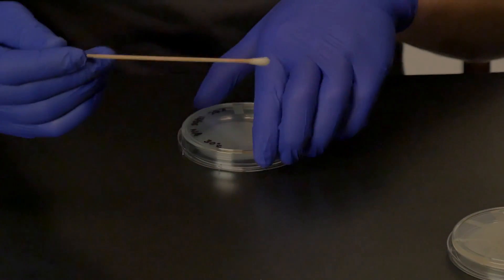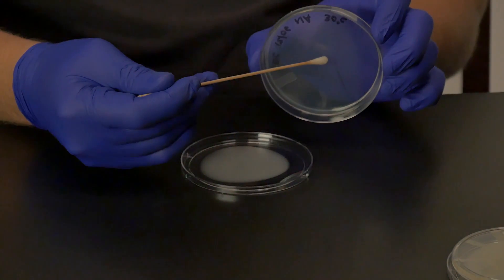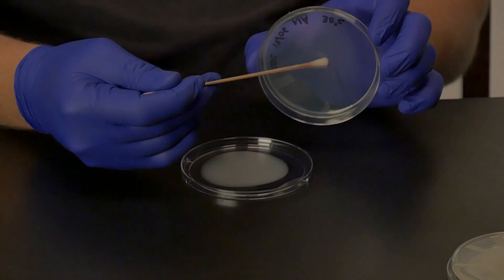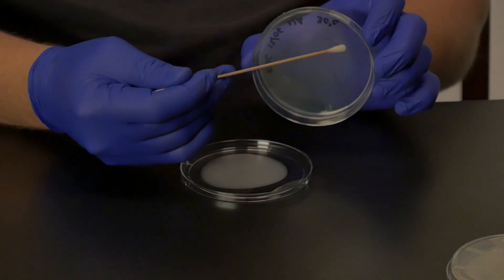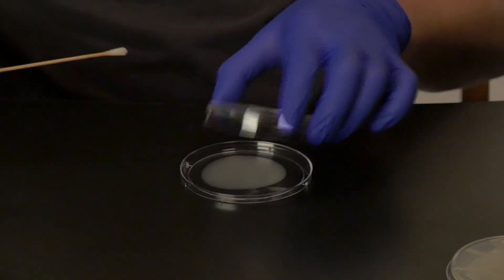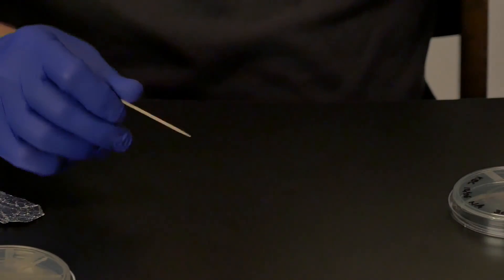Take a sterile toothpick and touch it to the positive control that the instructor has given you. Start close to the hub of the wheel, next to the line of the pathogen, and transfer some of your sample to the agar surface. Then drag the toothpick towards the edge of the plate, and as you do so you will drag it through the outer ring of the pathogenic bacteria that you have previously spread. Discard this toothpick. Obtain a new sterile toothpick and do this again on the opposite side of the plate using the same positive control.